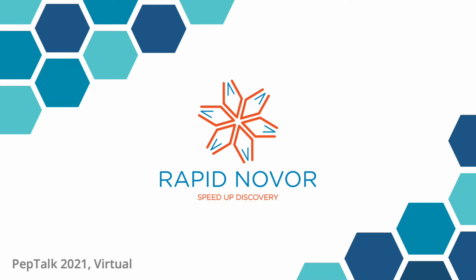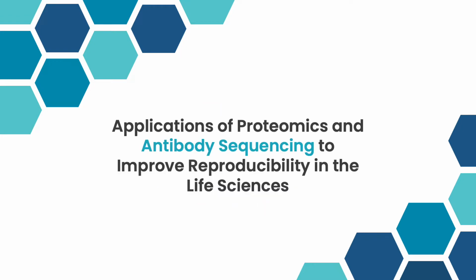My name is Clayton Moore from Rapid Novor, and today we're going to be talking about some applications of proteomics, specifically antibody sequencing and how it can act as a tool to improve reproducibility in the life sciences. I'm going to be focusing on antibodies specifically because of their sheer ubiquity in the life sciences and just how much we rely on them in our day-to-day research. But it's important to note that the same proteomics approaches we discussed today can really be applied to any protein to further characterize it.